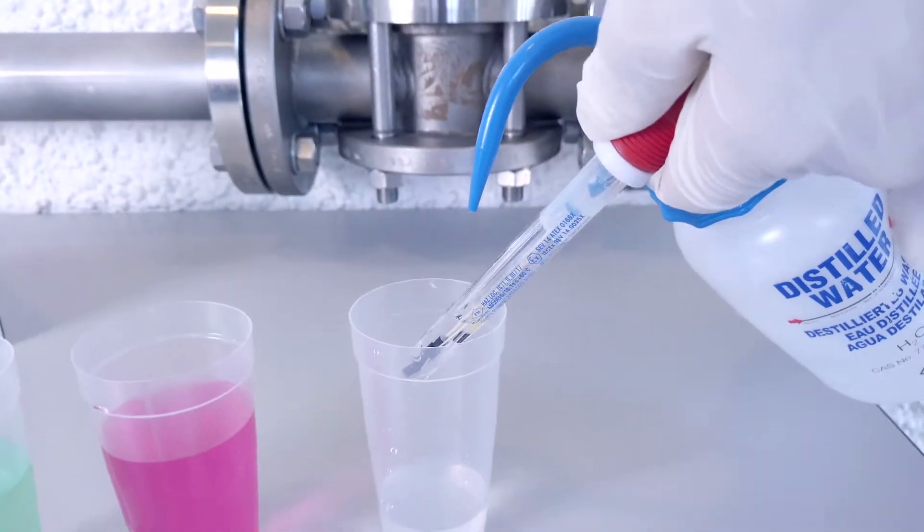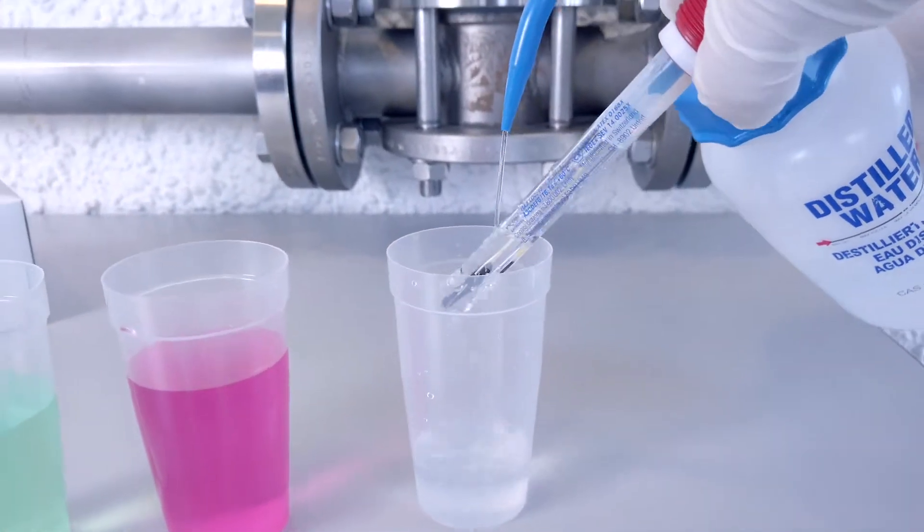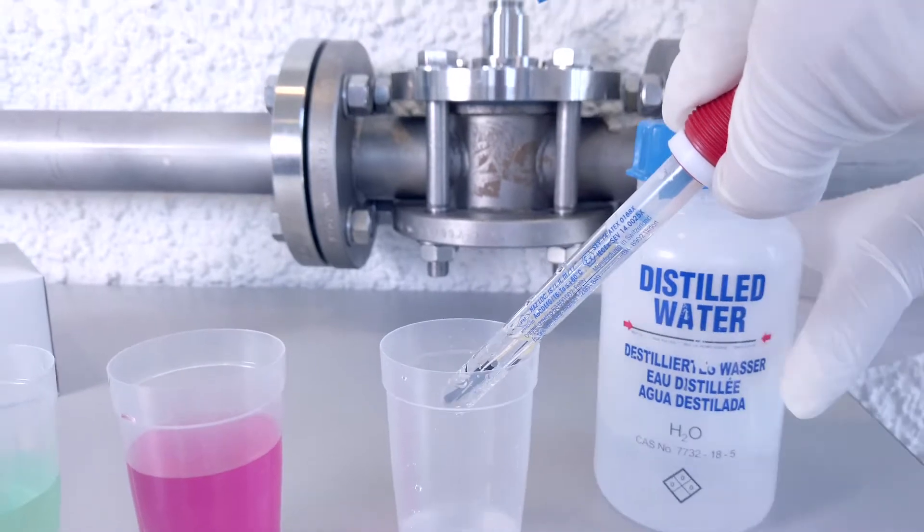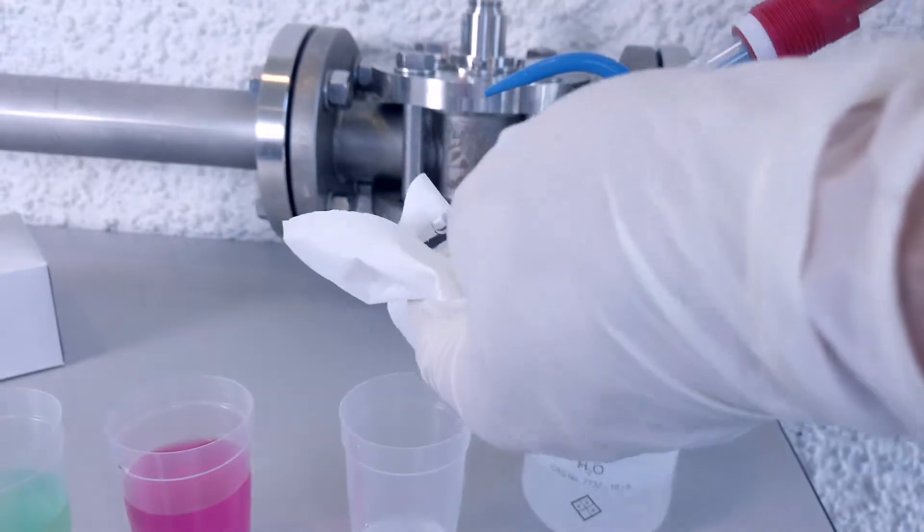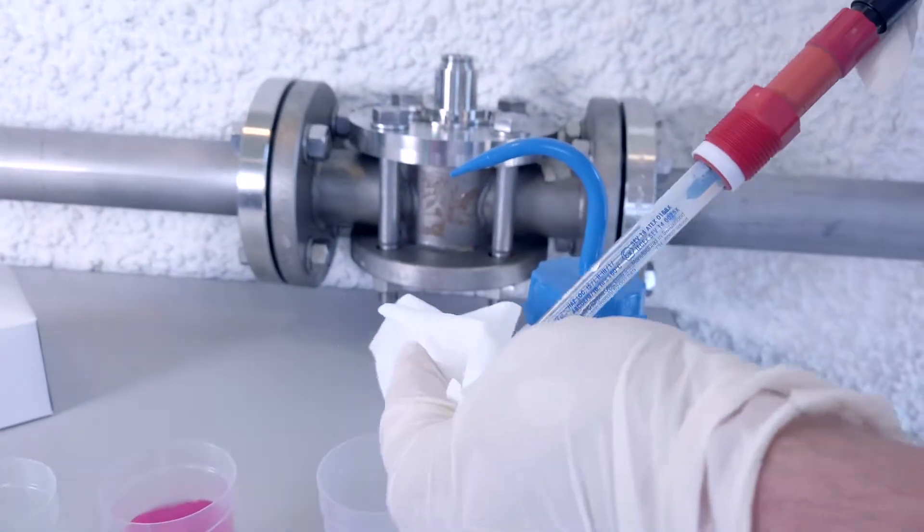Before you start to calibrate you need to rinse the sensor with distilled water in order to remove any possible contamination then dry it. Don't rub the sensor but gently pat it dry. Rubbing can induce an electrostatic charge which can affect the measurement.